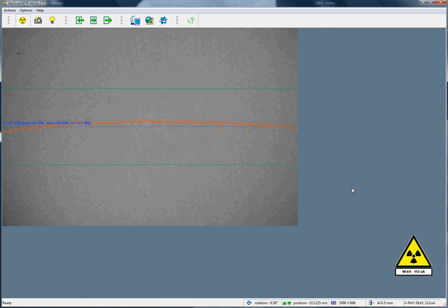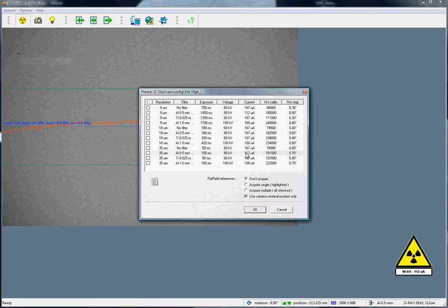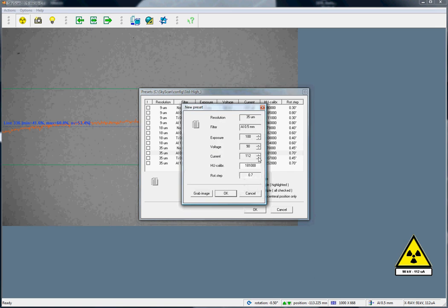Then, how is this accomplished? First of all, we click on options and enter the scanning modes. We select our mode, which in this case is the 35 µ resolution level and the 0.5 mm filter. We double click on it, and we change the voltage from 90 kV to 70 kV.